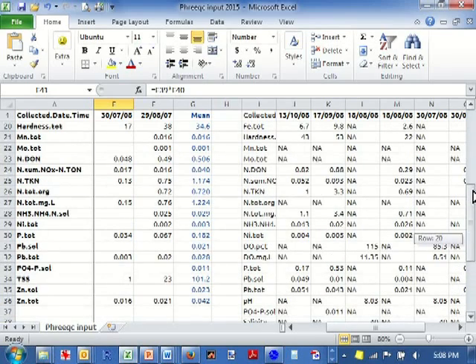Compare that with the number for iron total. What that probably means is that when the analysis is done, we're not filtering out enough finely colloidal material, which is going through the filter, so there are some iron-bearing solids in there, probably minerals like ferrihydrite, which are actually going through our analytical machine.